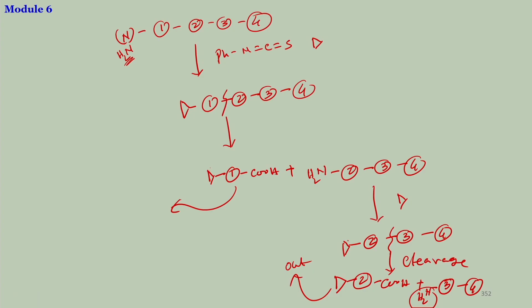So ideally these 3 are the methods that are used for determining the sequence of a given protein sample. One is Sanger's method, mostly used only for the N-terminal nowadays. Second, and most widely used, is the Edman degradation method, which is nowadays done automatically in an automated machine.